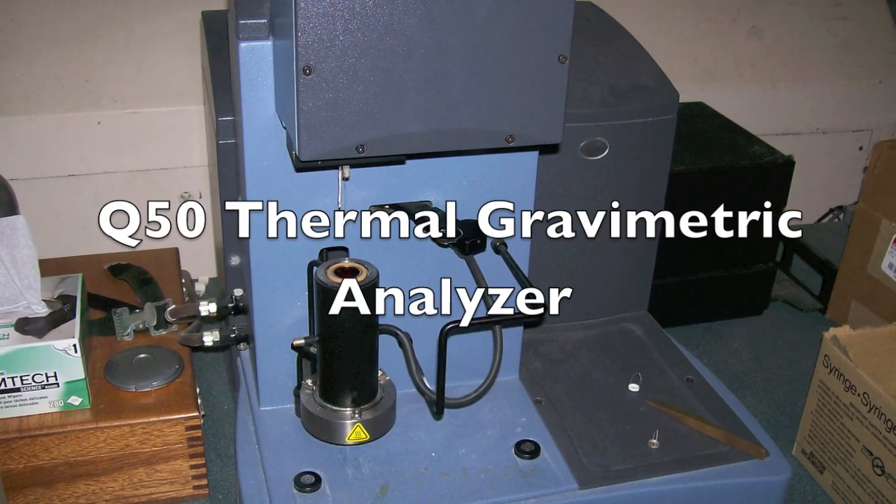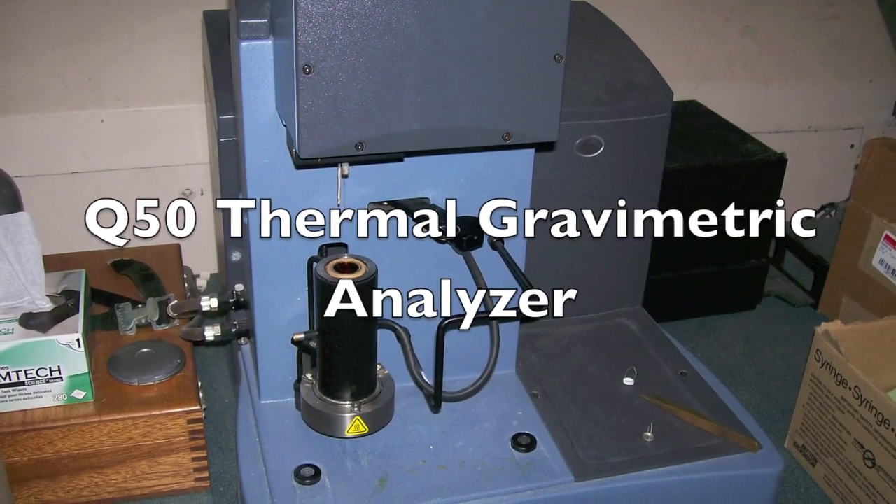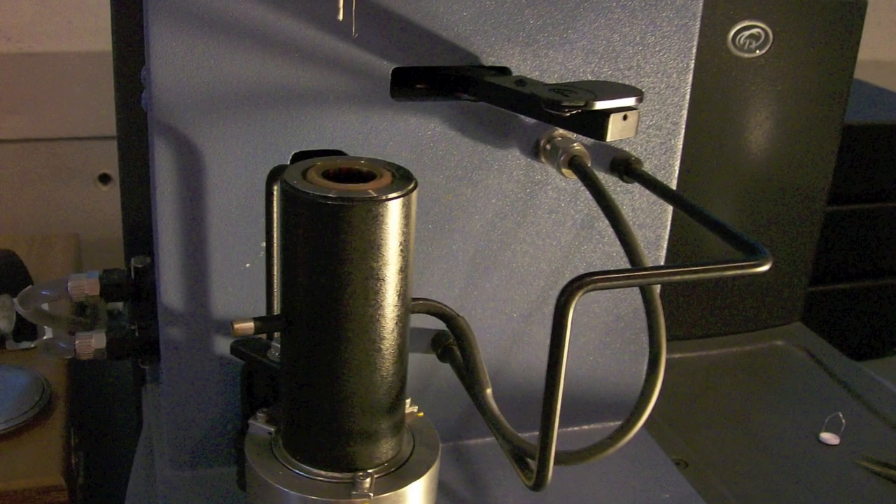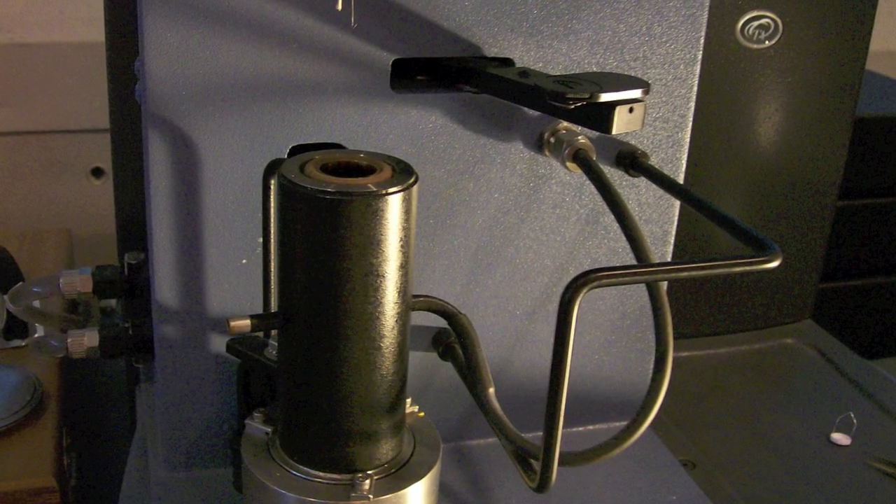The Q50 Thermal Gravimetric Analyzer measures the weight loss or degradation of a sample as a function of temperature. It helps to determine important material temperatures and the composition of a material.